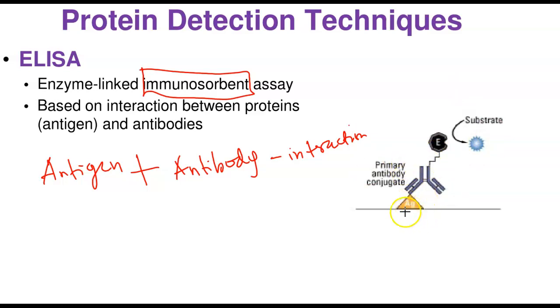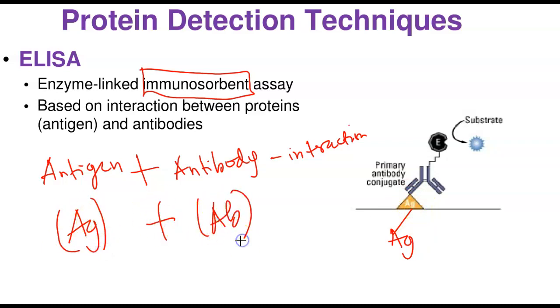So this picture shows you. Now this is the antibody. Sorry, this is the antigen. Ag means antigen. The antigen is Ag. The antibody is AB. Now, the antigen interacts with this antibody because it's specific. This is highly specific for it, and it forms agglutination. Now, how do you measure that agglutination or precipitation? That can be done by telling you the activity of this enzyme, because the enzyme is used as a marker.